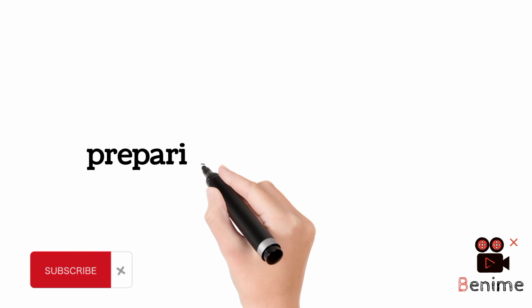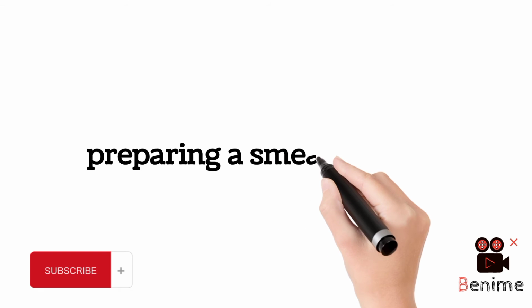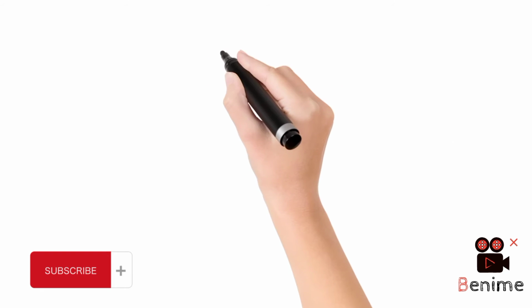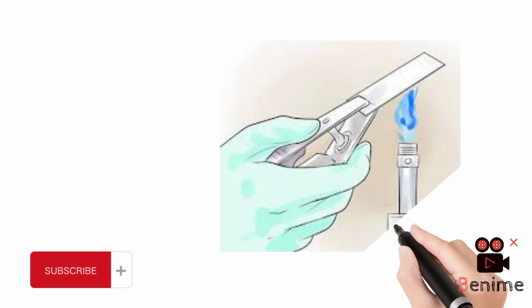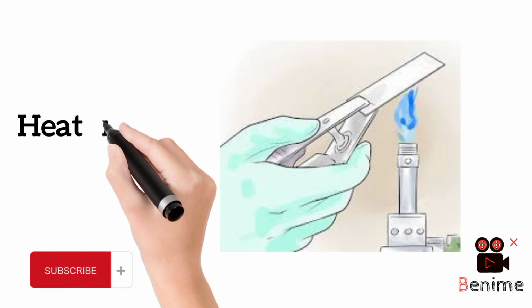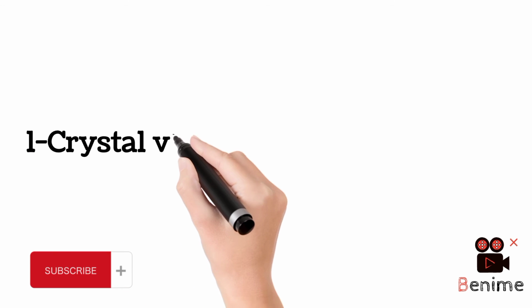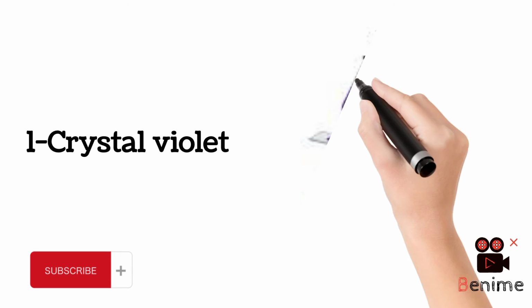The second main step is preparing a smear of that culture. Put 1 drop of culture on a slide with the help of a dropper and spread it in a normal layer, not too thick or too thin. Then, heat fix the drop as you have seen in the video. Then apply crystal violet stain on it and wait for 2 minutes, then wash with tap water.